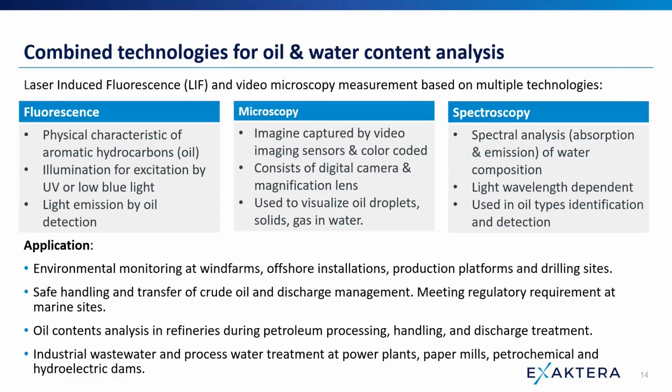hydrocarbons in water. This is important for ensuring drinking water quality as well as monitoring accidental releases, for example around offshore oil production platforms and drilling sites, or offshore installations like wind farms. The various analytical techniques can be used simultaneously to excite hydrocarbon molecules and detect their presence based on the resulting optical emissions in fluorescent spectroscopy.